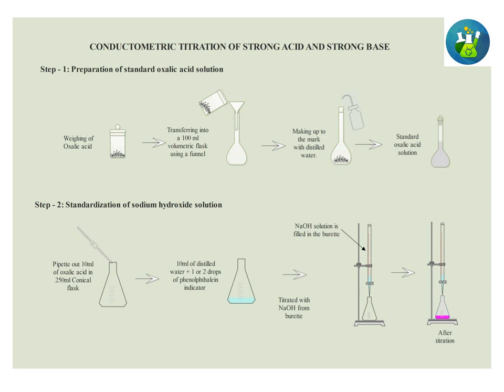That means their concentration changes from time to time. To standardize the sodium hydroxide solution, we need a primary acid, and that primary acid solution is oxalic acid, but mostly potassium hydrogen phthalate is preferred. It is used, but for convenience for undergraduate students, we prefer to use oxalic acid solution.